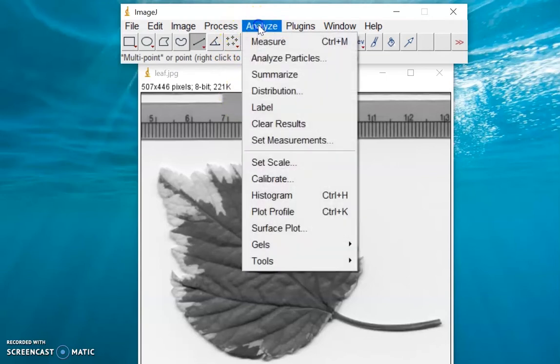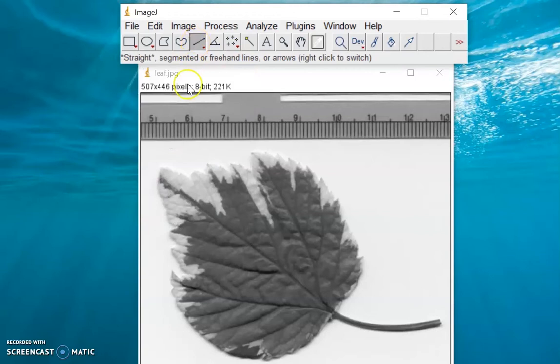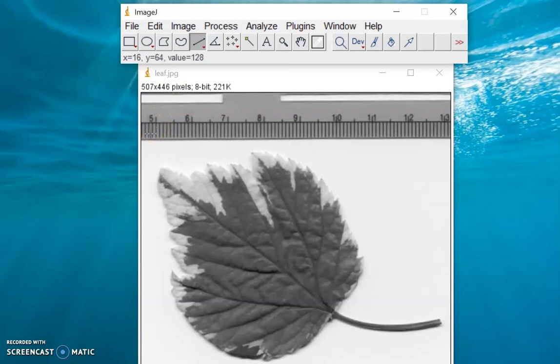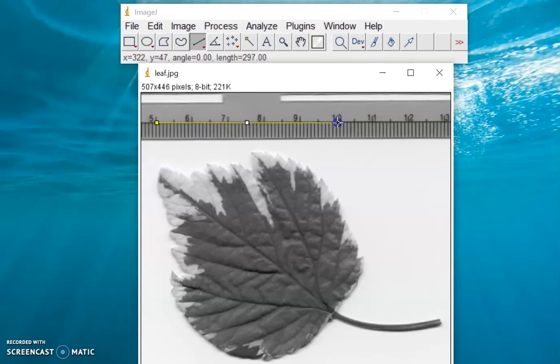We set the measurement scale by clicking Analyze, then Set Scale. But before doing this, you should draw a line first. Draw a line over a 50mm section of the ruler given here — from here up to 10 — then just try to make the line straight.